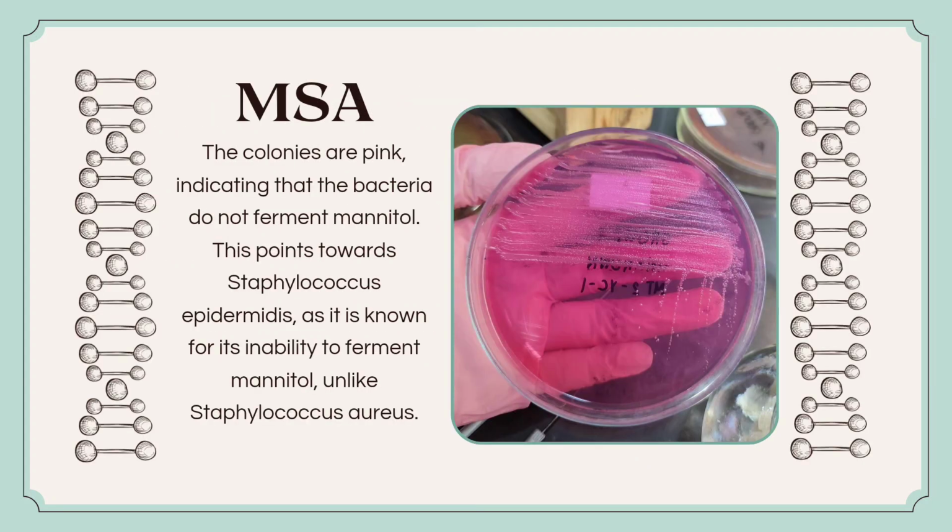Now we have the MSA, or the mannitol salt agar. The colonies are pink, indicating that the bacteria do not ferment mannitol. This points towards Staphylococcus epidermidis, as it is known for its inability to ferment the mannitol, unlike the Staphylococcus aureus.